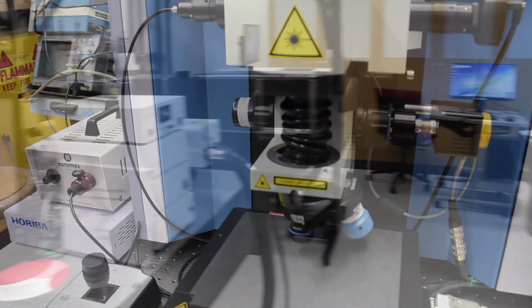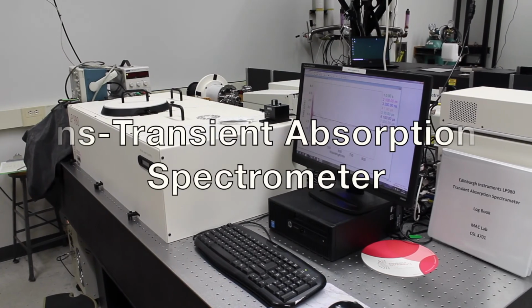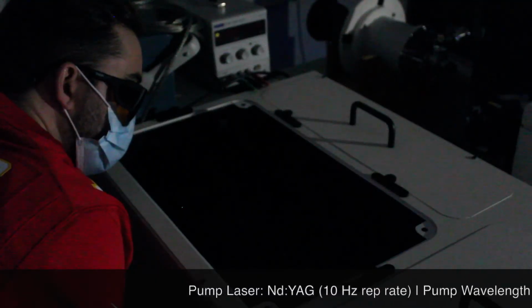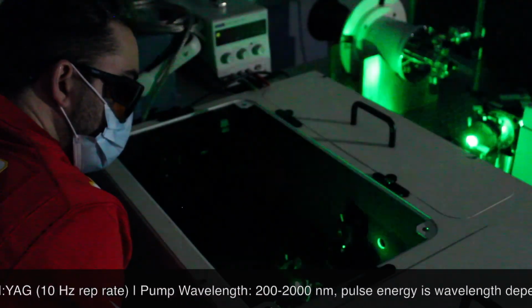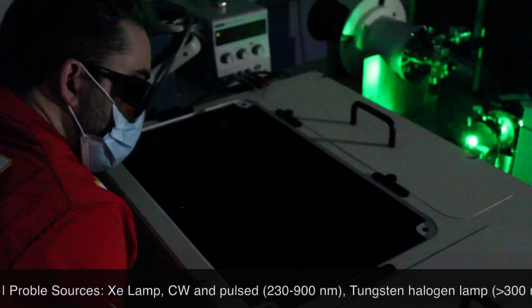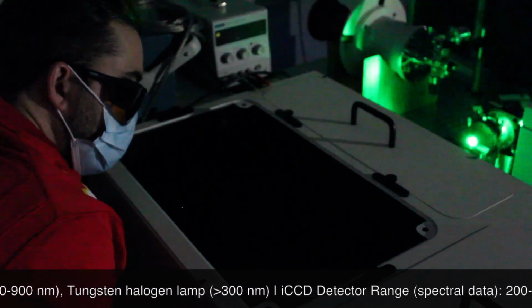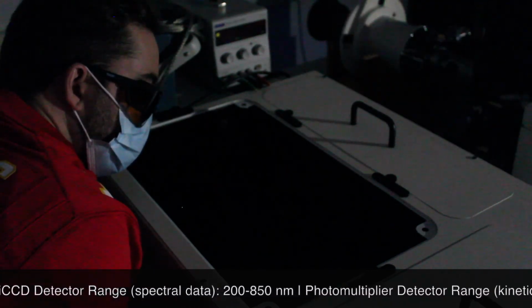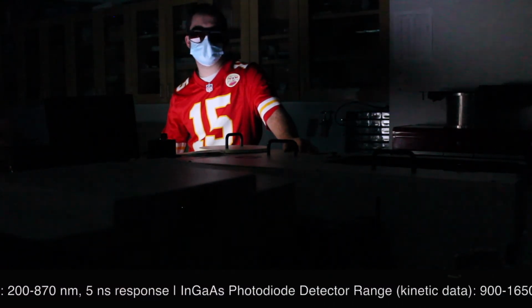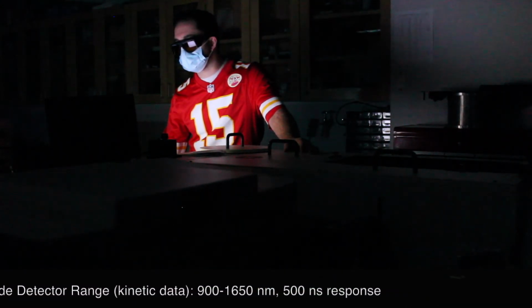The nanosecond transient absorption spectrometer, or TA, can measure ultra-fast electronic dynamics using the pump-probe model of spectroscopy. Laser-induced transient absorption and emission kinetics and spectra are observed using either a kinetic detector or a gated intensified charge-coupled device detector, and using time gates as short as 10 nanoseconds. Liquid and thin film samples can be investigated in this instrument.